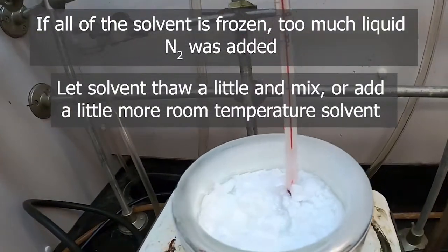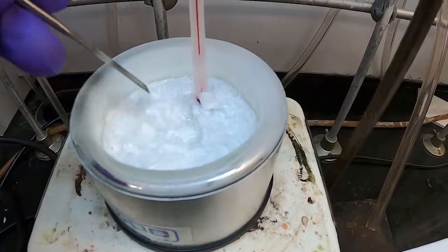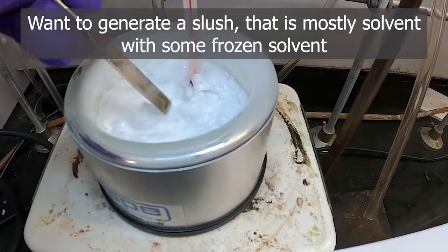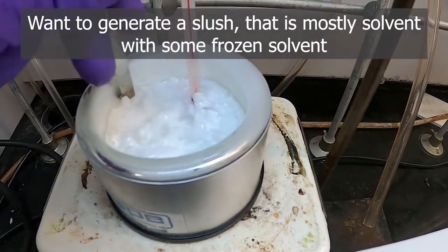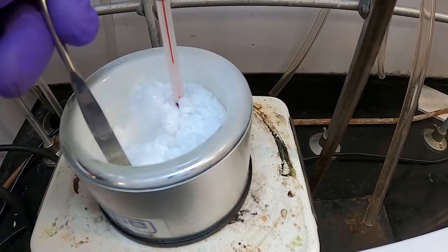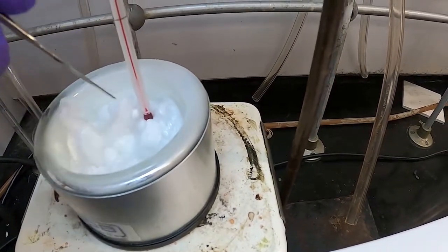I think it's worth reiterating that the goal of one of these baths isn't to completely solidify the solvent you're using. You're trying to generate frozen solvent in the liquid solvent, kind of this slush we've got here, and the nitrogen is just a way to cool down that solvent to its freezing point so that we can generate this slush. There we go. Now that this is starting to thaw a bit, we can break it up.